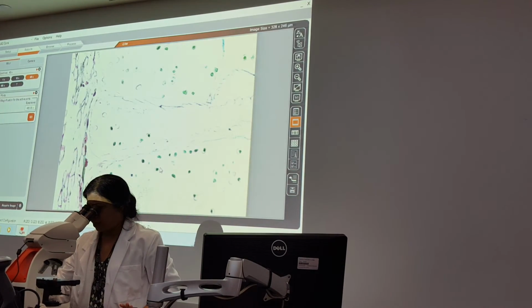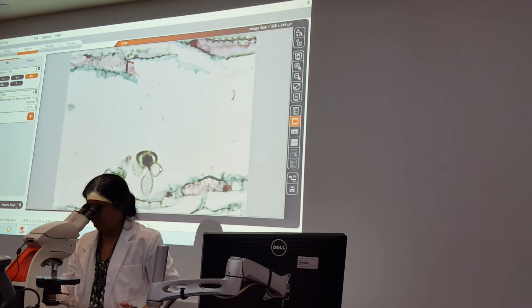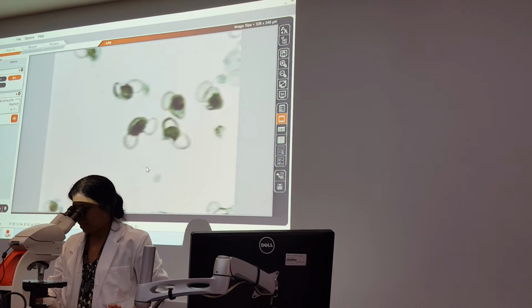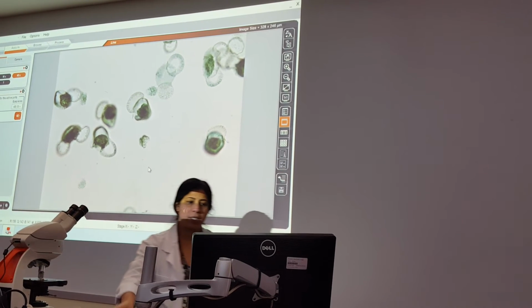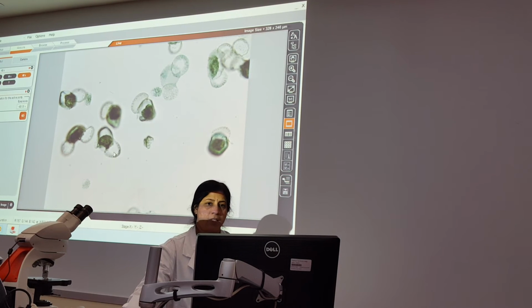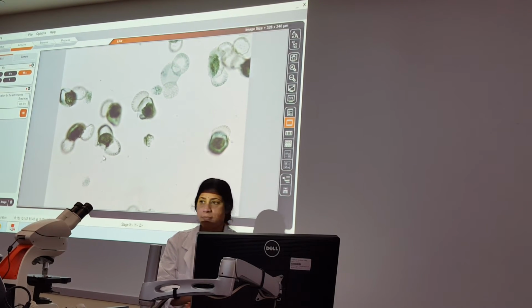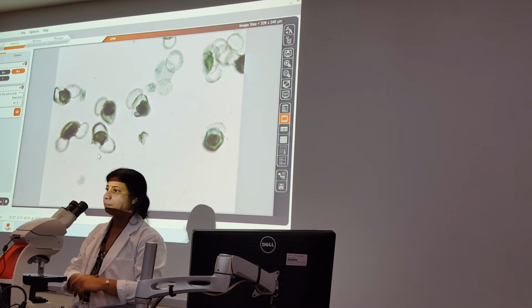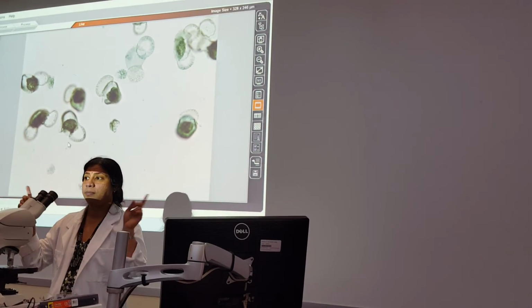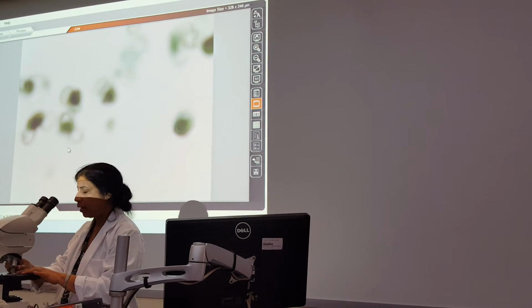And if I further zoom in and ask you, how is the pollen dispersed, what will you tell me? Air sac. So if I point to this ear of the Mickey Mouse, what is that? Air sac. Wings. Or you can call them air sacs. What is their use? Wind dispersal. Are we good? That's your pollen, male cone.